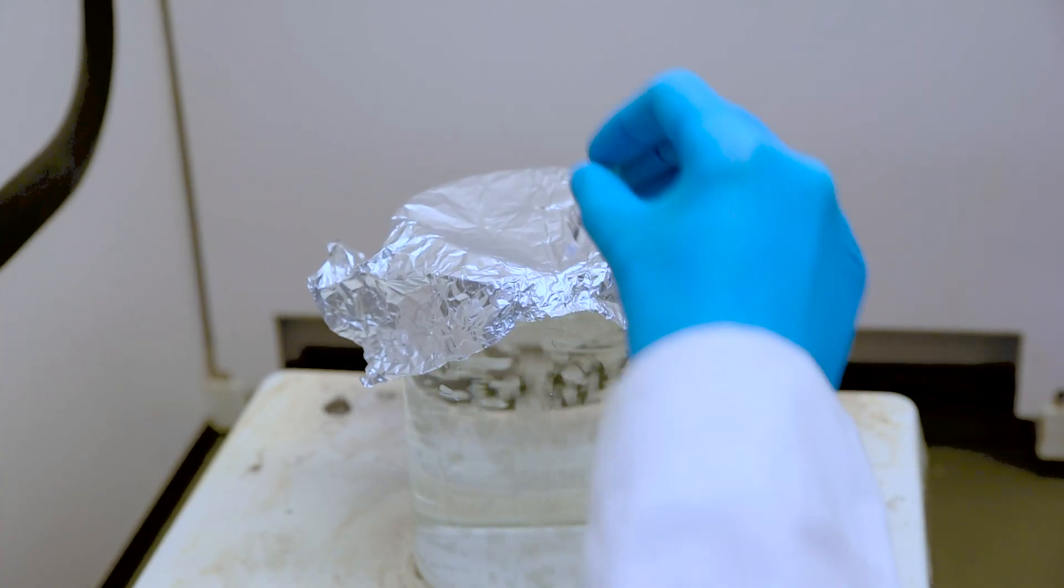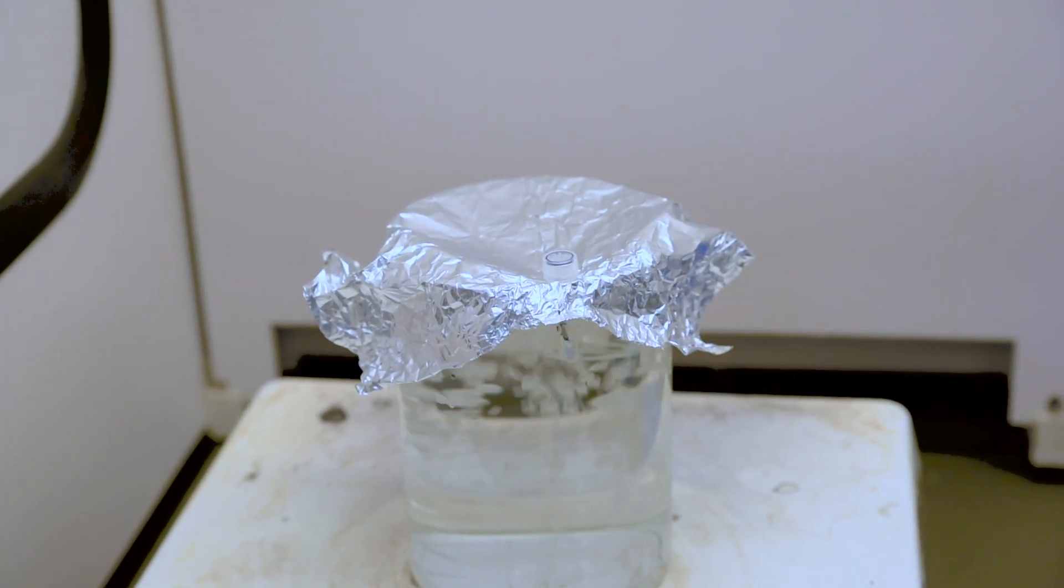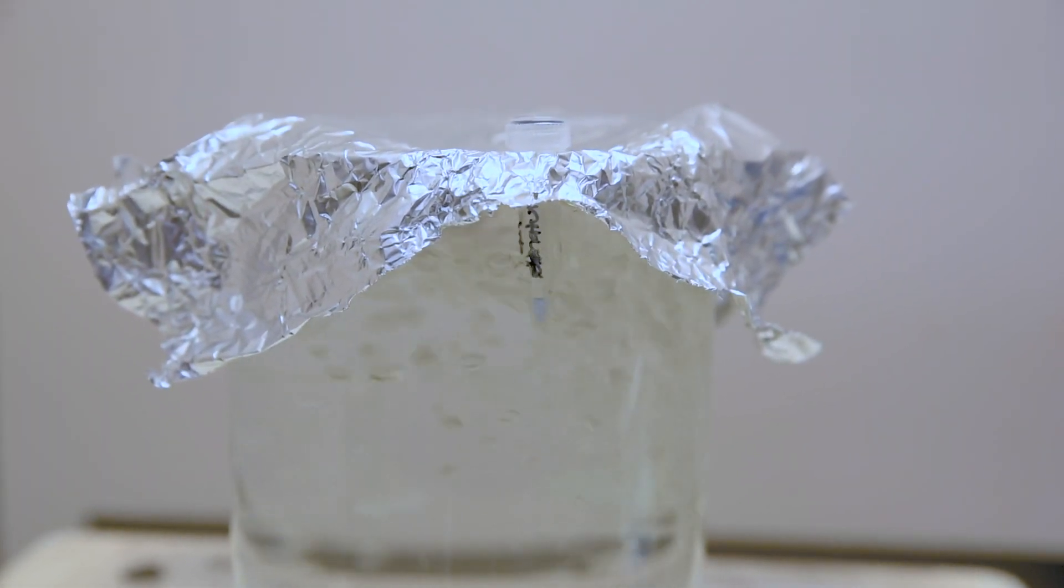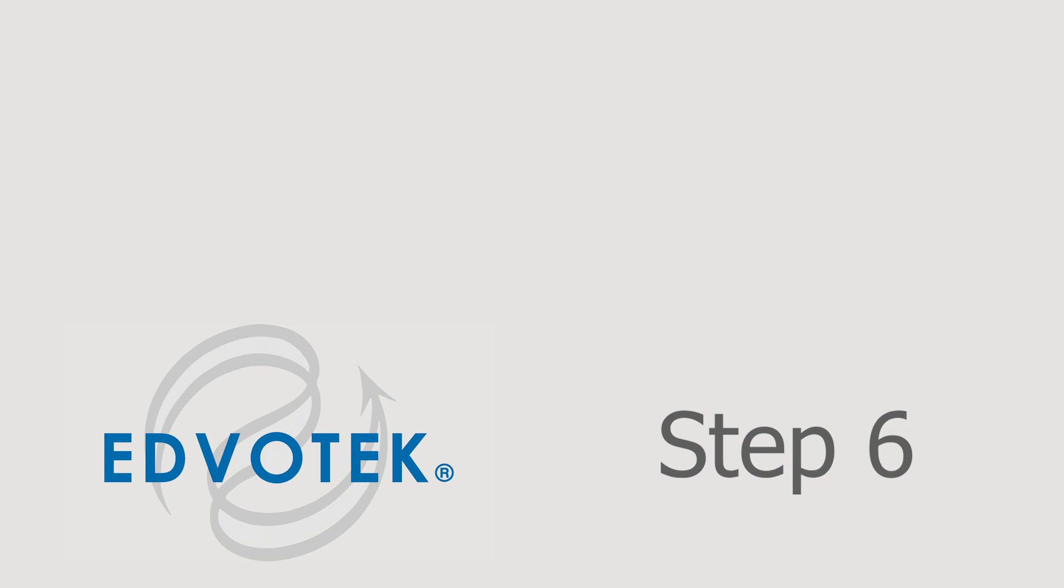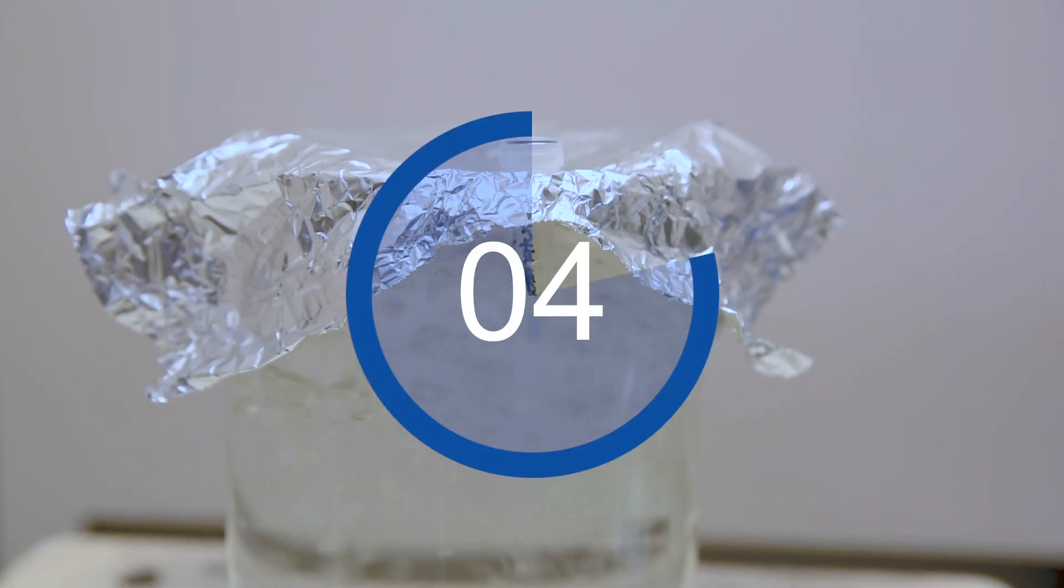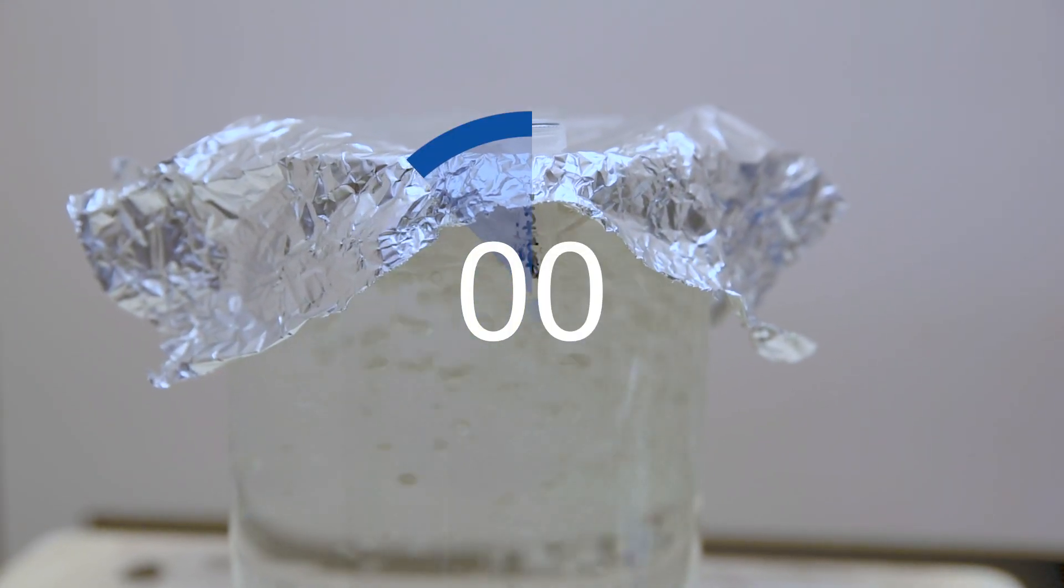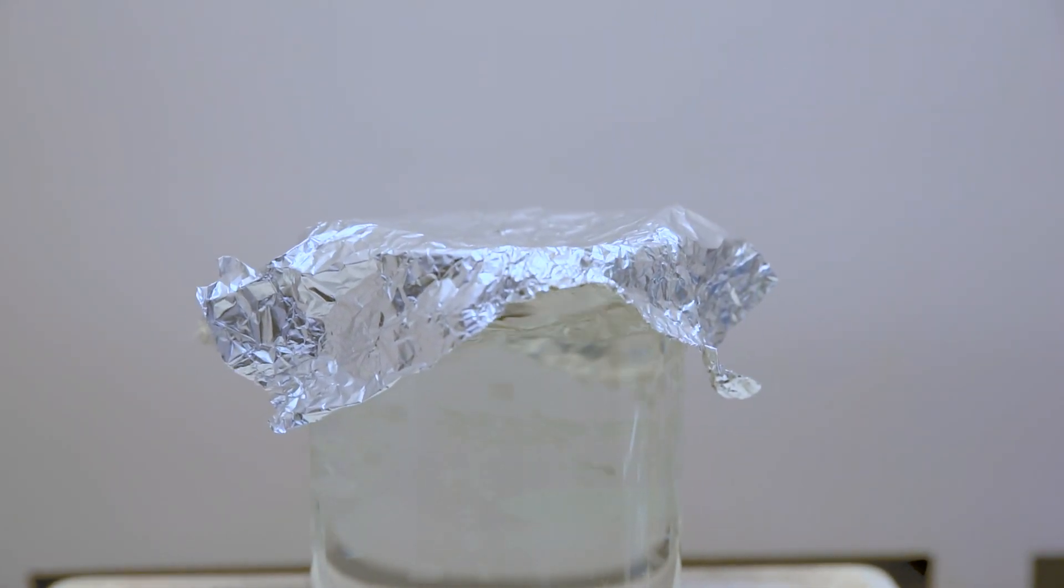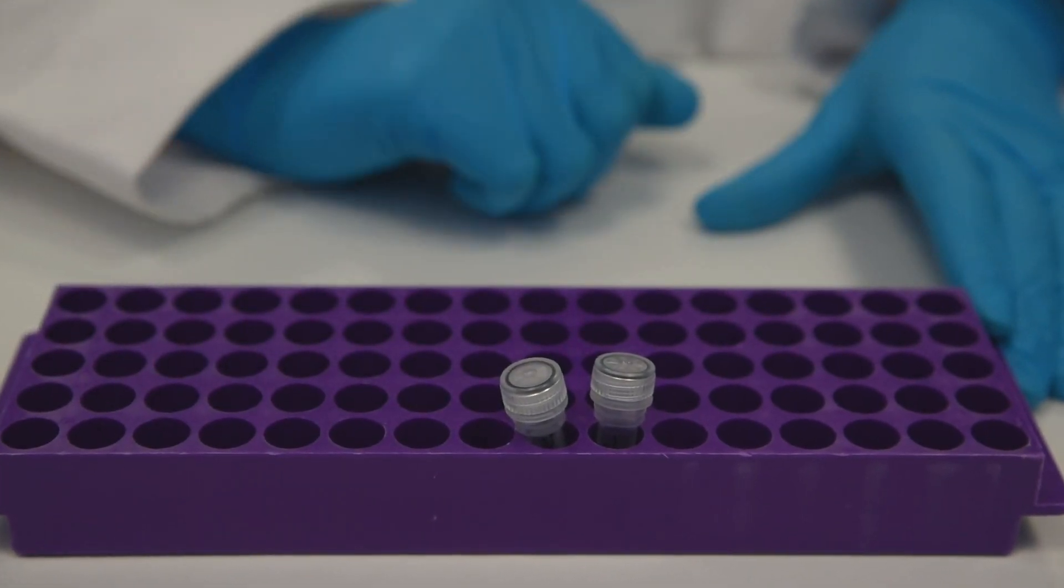Step 5: Push the bottom of the GFP sample tube to be denatured through the foil and immerse in the boiling water. The tube should be kept suspended by the foil. Step 6: Boil the GFP sample for 5 minutes. Step 7: Remove the sample tube from the beaker and allow it to cool for a few minutes at room temperature.